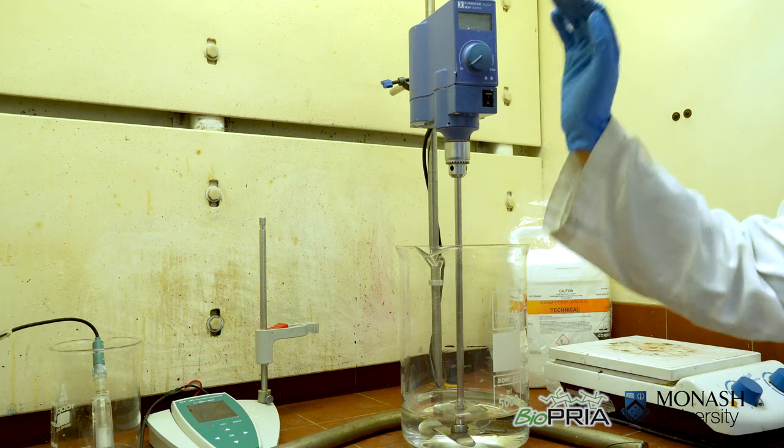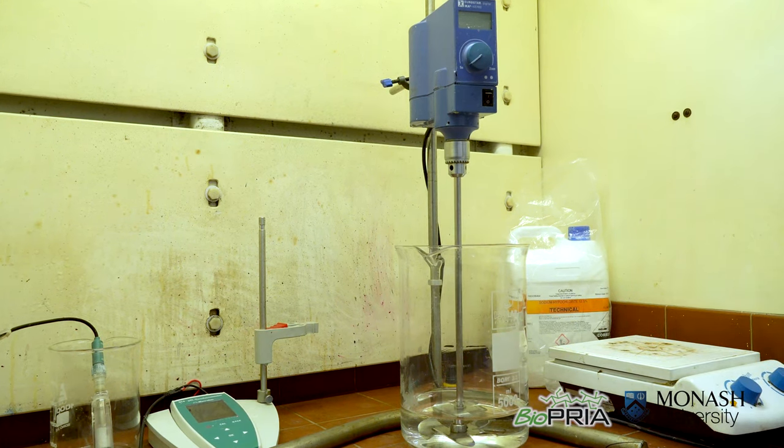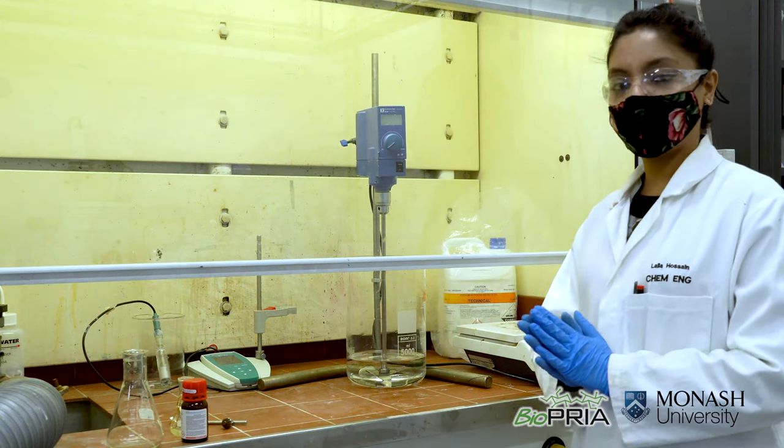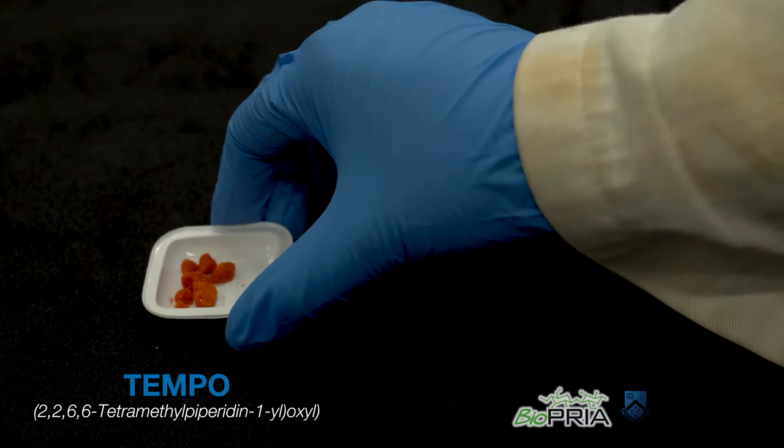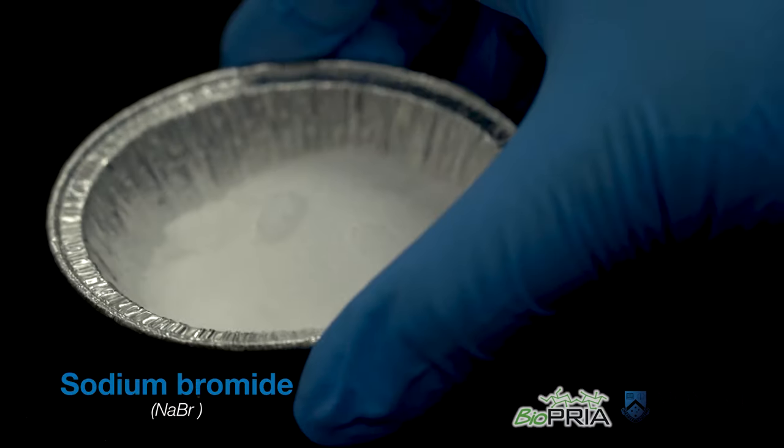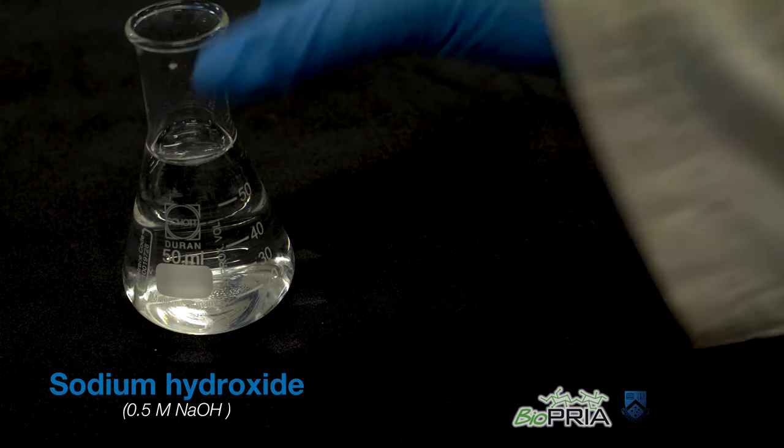We also need an overhead stirrer and pH meter to maintain the pH throughout the reaction. For this experiment we need bleached eucalyptus kraft pulp, TEMPO, sodium bromide, sodium hypochlorite, and sodium hydroxide.